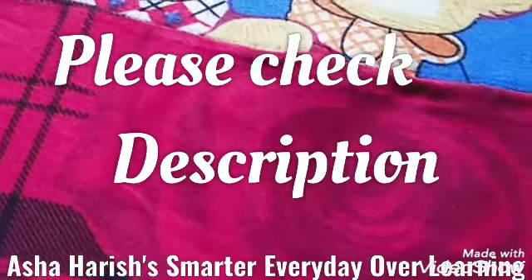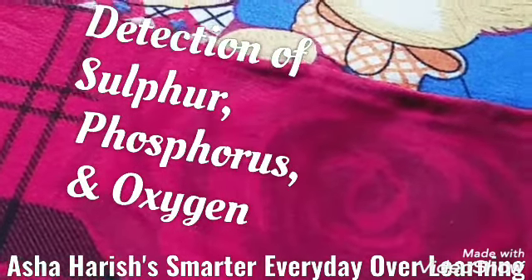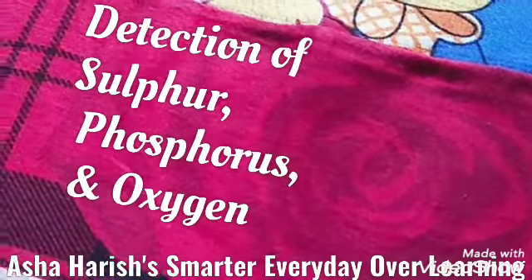Now students, in this session we are going to learn about detection of sulfur and detection of phosphorus, and the last one is detection of oxygen. Okay, let's get into the class.